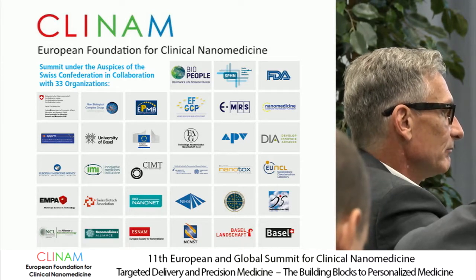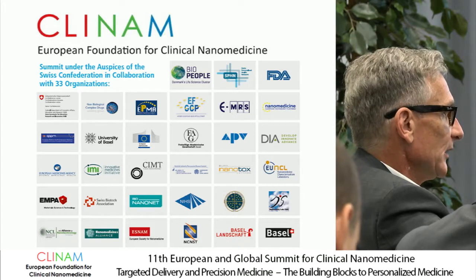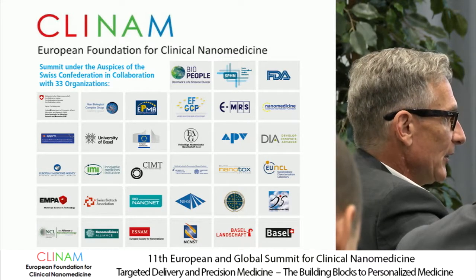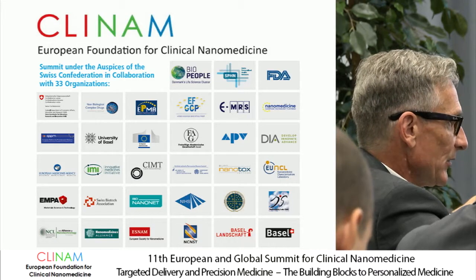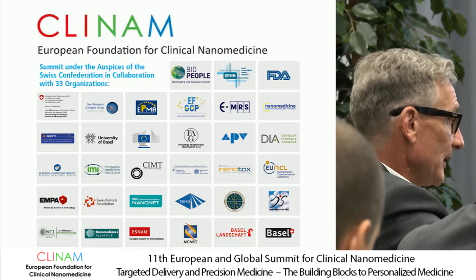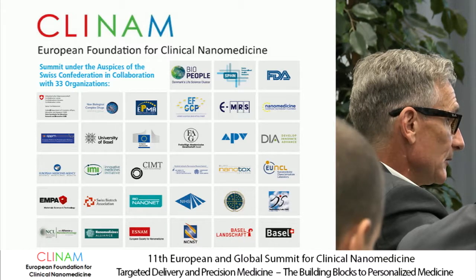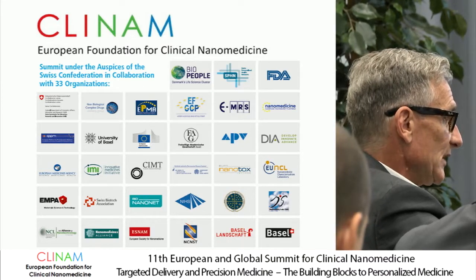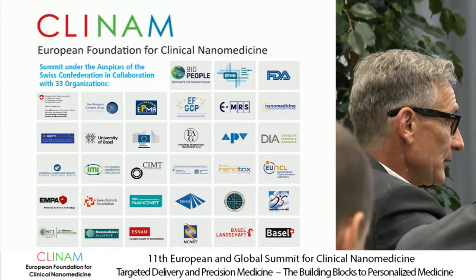So you also have to take into consideration, what for are you measuring it? Are you doing the batch comparison, where you have a standardized system in place, where you know what your risk is and what your variability is because you've characterized it before extensively? That is fine. You just need to provide the science to justify that. At the end, many of the innovations are driven by pragmatism, and we also have to be resource conscious. So the agency is not going to make you do unreasonable things for no good reason.